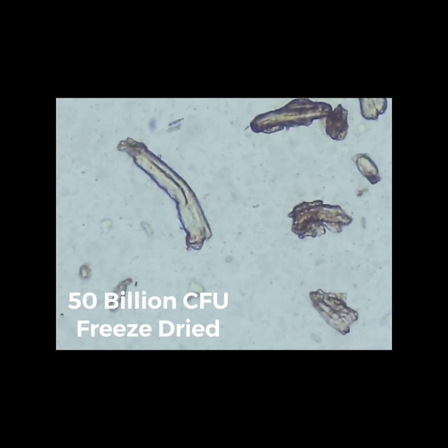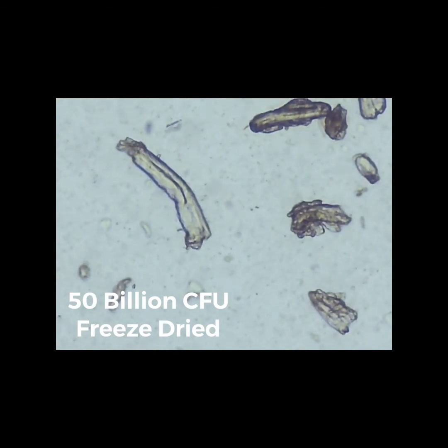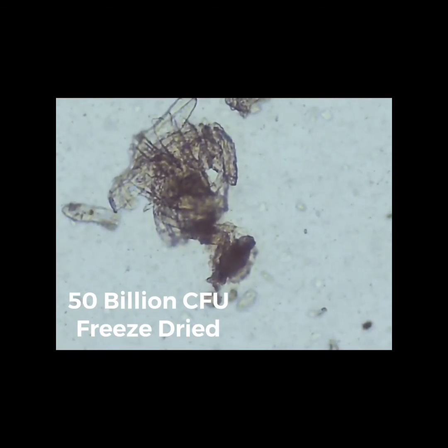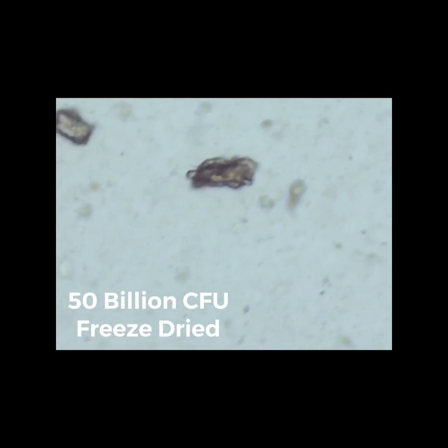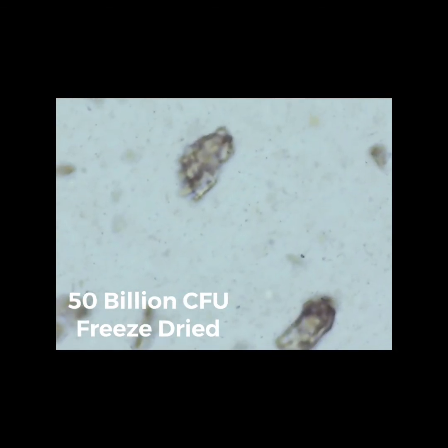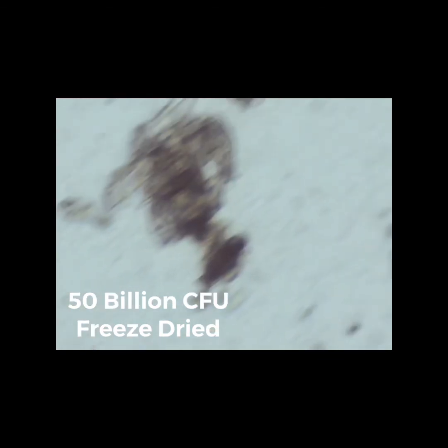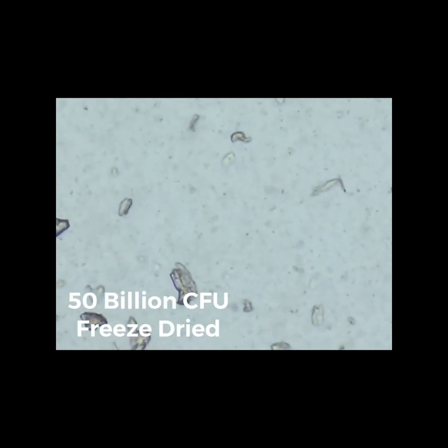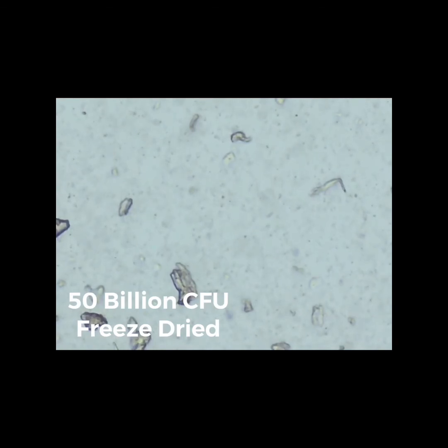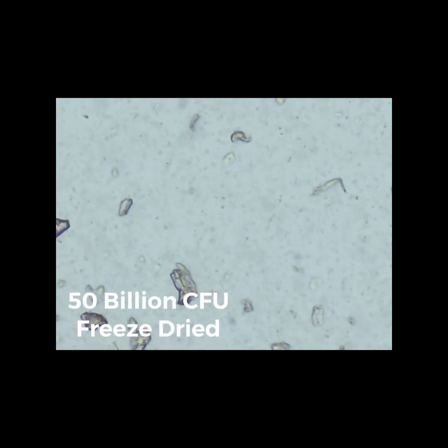Now, these dead cells — it becomes questionable as to where they come from. They're brown. Did you know that probiotics are cultured from healthy colons, healthy rectums, healthy bodies — but they get them from the colon and rectum. So most likely — I don't know for certain — but it sure does look like that's what's actually under the microscope. Buyer beware. Now we actually have proof as to what you are actually buying.